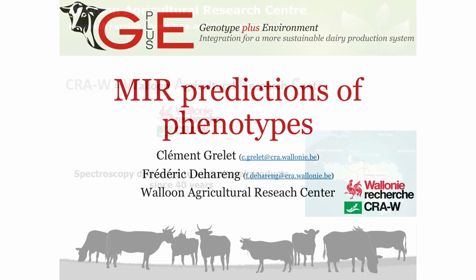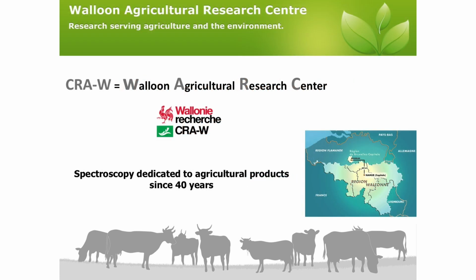Based in the Wallon region, the south part of Belgium, we work with spectroscopy dedicated to agricultural products since around 40 years. And we try to predict new models based on these techniques.